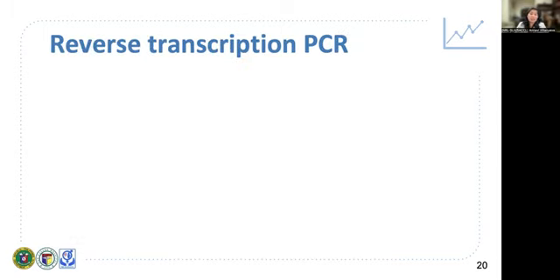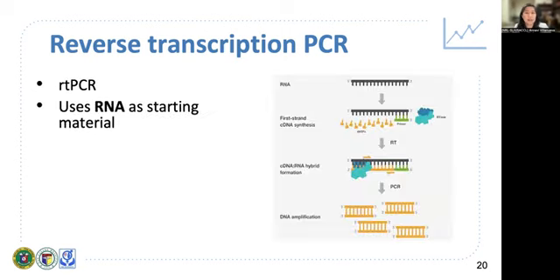Okay, now we proceed to the different formats of PCR. So yung kaninang pinresent ko sa inyo, that's your conventional polymerase chain reaction. But sometimes it's not enough. Sometimes we need other formats. So I'll present to you now reverse transcription PCR, also called RT-PCR, which uses RNA as your starting material. So RNA as your starting material, parang familiar, saan siya commonly used? So sa mga, if you want to detect RNA viruses, for example, like your SARS-CoV-2, your HIV, dengue, you have RNA as your starting material.